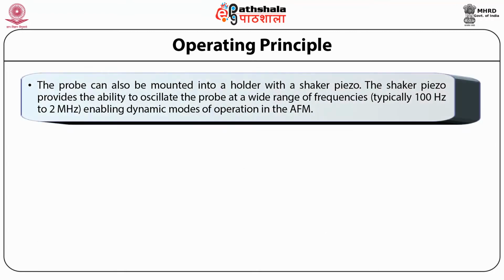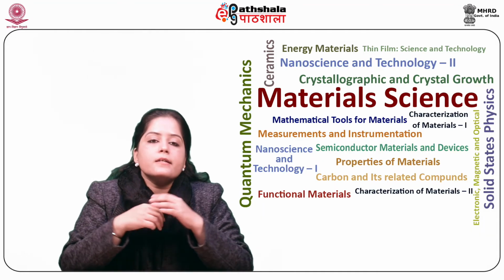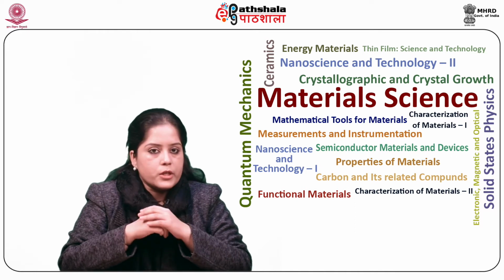So the probe can also be mounted into a holder with a shaker piezo, which provides the ability to oscillate the probe at a wide range of frequencies, typically between 100 Hz to 2 MHz, enabling the dynamic modes of operation in AFM. So the dynamic modes of operation can be performed either in the resonant modes or in non-resonant modes. Let us now discuss the static mode of AFM imaging.